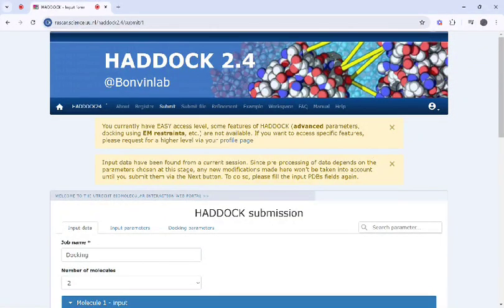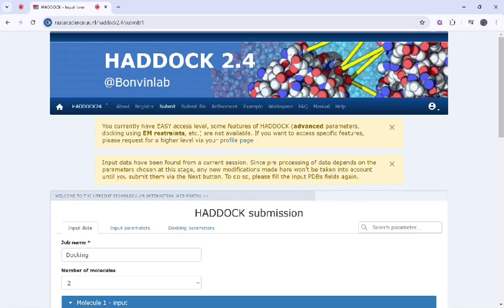Welcome back to the Bioinformatics Hub. Today we will learn how we can perform protein-protein docking using HADDOCK server, which is a powerful tool for protein-protein docking.